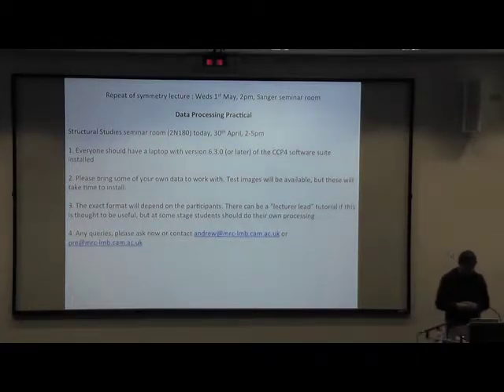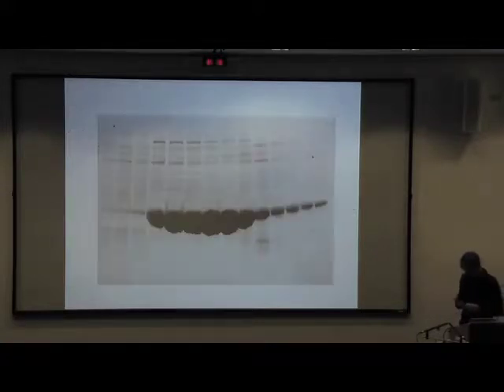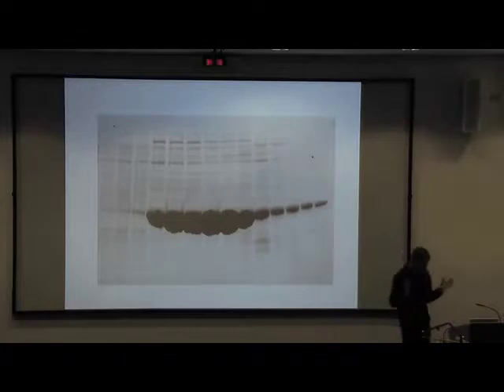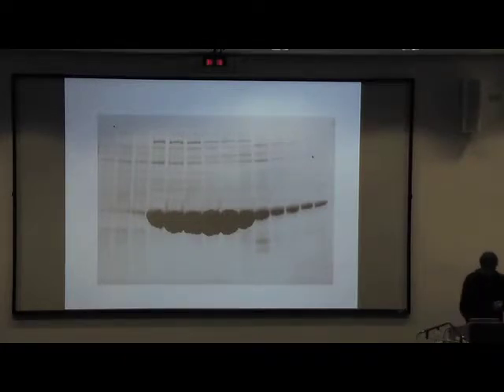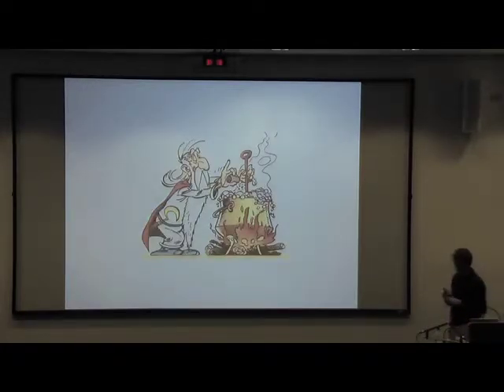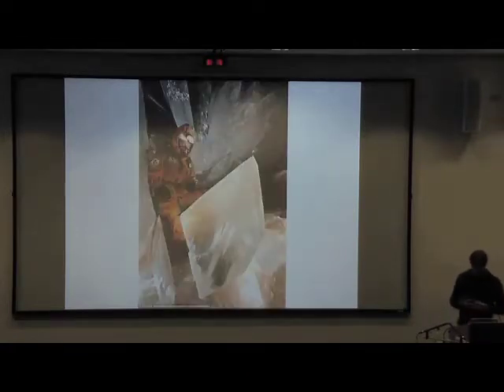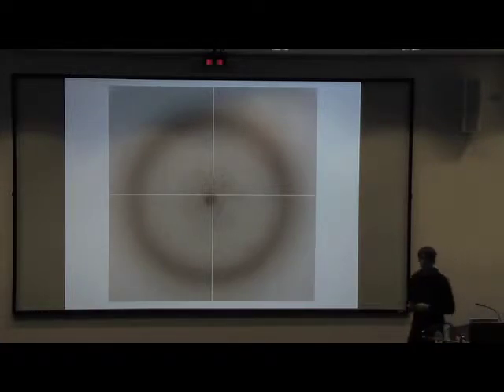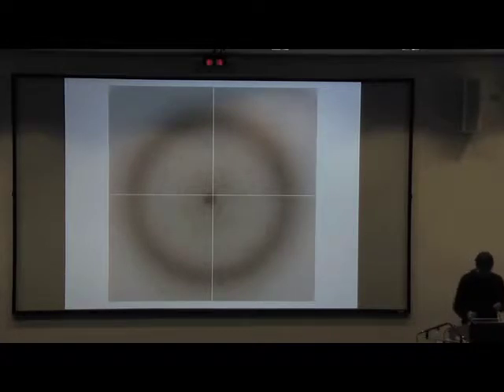All right. So the goal of today is you've got a bit of protein, reasonably pure. Then you do something magical, and then somehow you get yourself a crystal. This is, by the way, real. It's not protein crystal, though. And then you shoot some X-rays at it, and you get a beautiful diffraction. And that's the goal of what we're trying to do today. Well, not just in one day.